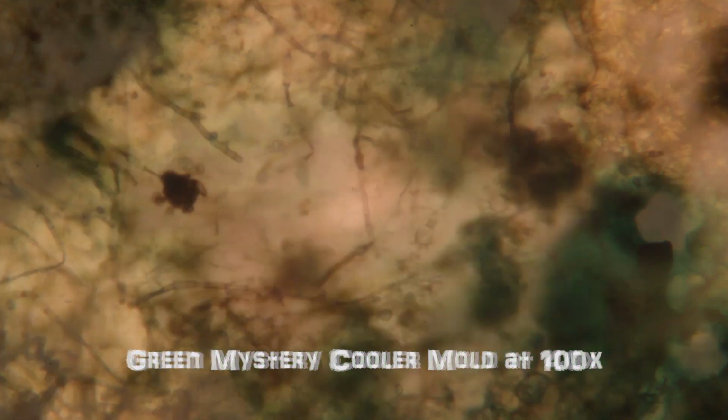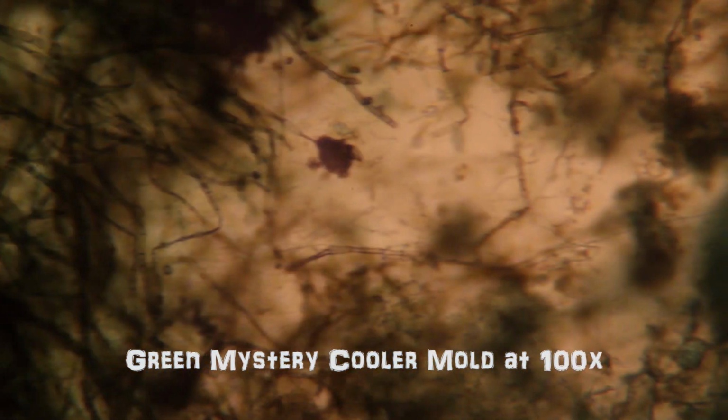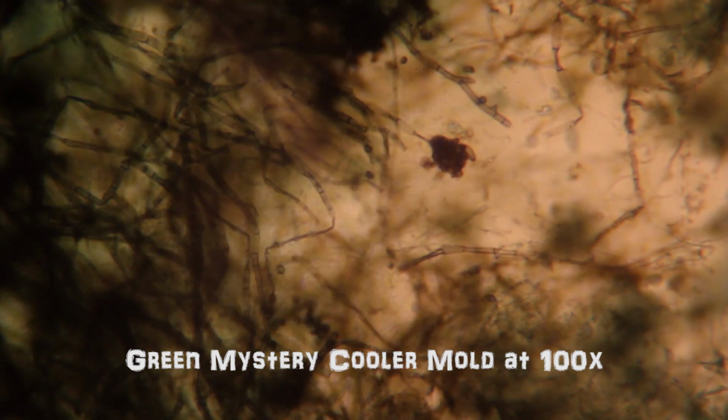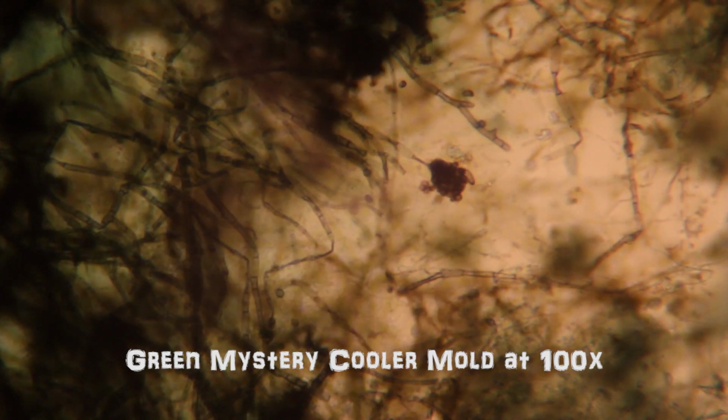Here's a little more of the green mystery cooler mold at 40 times, and what you'll notice is this stuff, which appears to be almost gelatin. Okay, here it is at 100 times magnification. And when you start getting in this close, you'll notice how I can only keep a certain portion of it focused in at a certain time. That's just because of the sensitivity of the focal plane as I move it in and out of focus. I can have only a very small portion focused in at any time because of the sensitivity. You'll also notice on the fibers what almost appears to be some sort of sectioning.